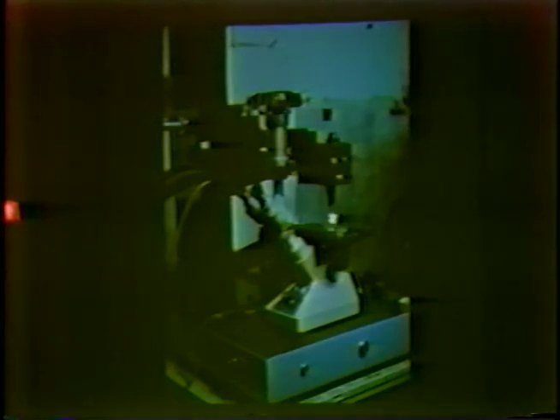So we put an inverted optical microscope underneath there, and then when the water immersion lens here was brought down into the dish, we could look through the inverted optical microscope and see the image using the TSM as a non-confocal source of illumination for this microscope.